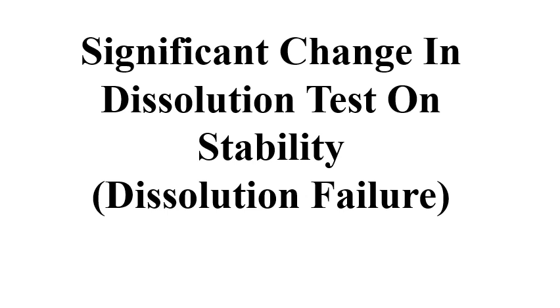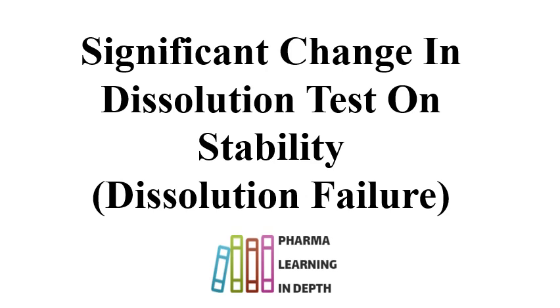Welcome to the video on significant change in dissolution test on stability. Simply you can say it as dissolution failure on stability. Many of the times the pharmaceutical professionals face this problem of dissolution failure for the stability samples of the pharmaceutical formulations.